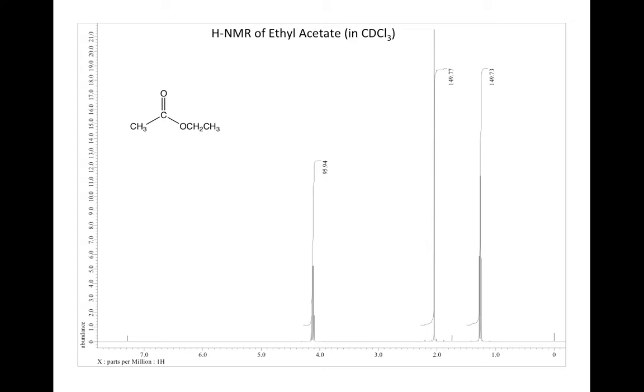So we're starting out with ethyl acetate. I've shown the structure up here. It's a common solvent, so you might actually run into this as a contaminant in some of your spectra, so it's a good one to become familiar with.